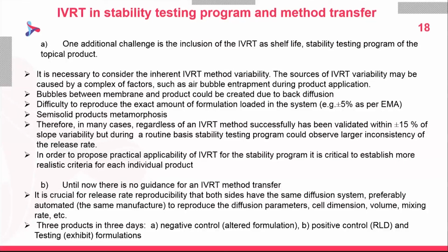The sources of IVRT variability, as we discussed, can be a complex of factors, such as bubble entrapment during product application. Bubbles between membrane and product could be created due to back diffusion. Membrane quality might slightly change during the manufacturing of the product for the long-term stability study.